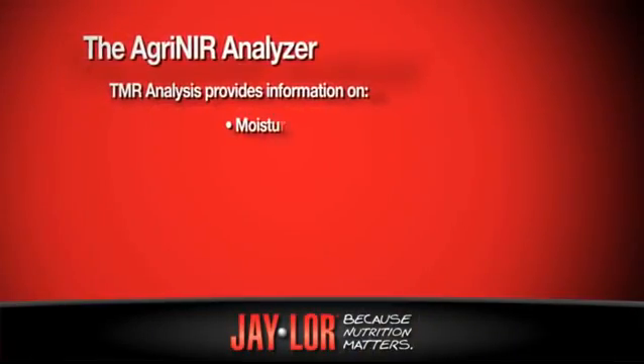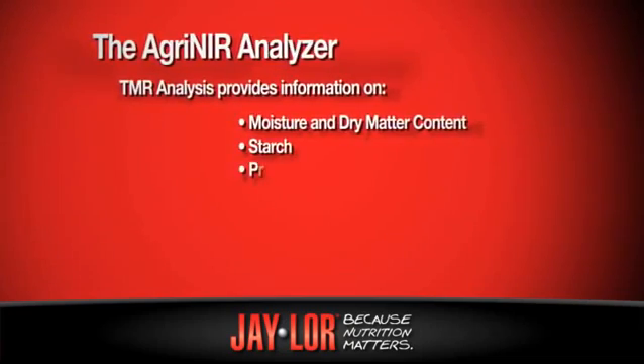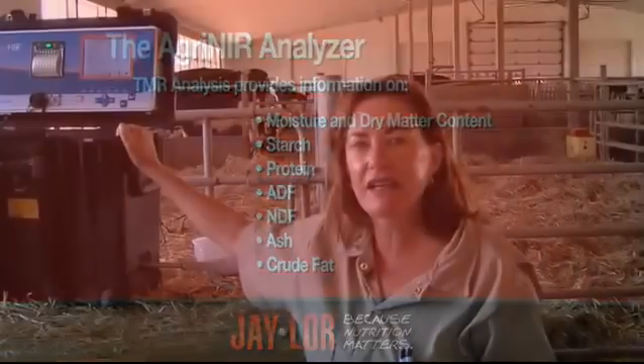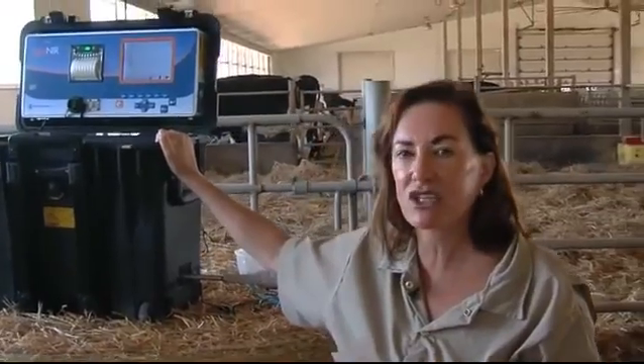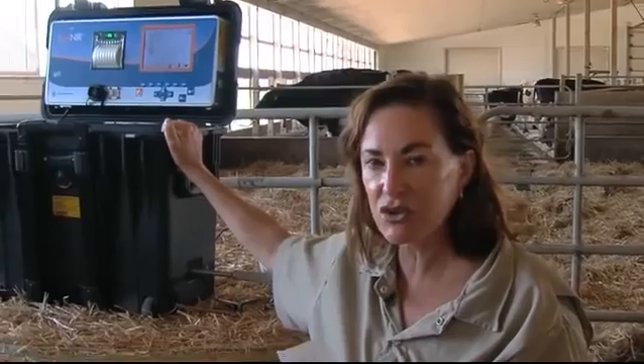I'm given the moisture content and dry matter of the TMR, the starch, protein, ADF, NDF, ash, and crude fat. This piece of equipment is the future for TMR feeding. It will fine tune the ration on a daily basis. Getting your TMR finely tuned is important because nutrition matters.